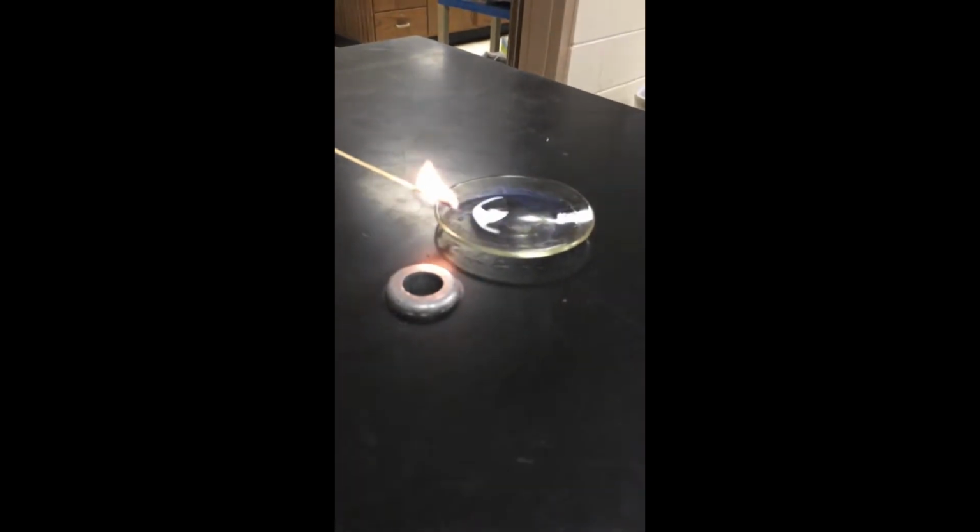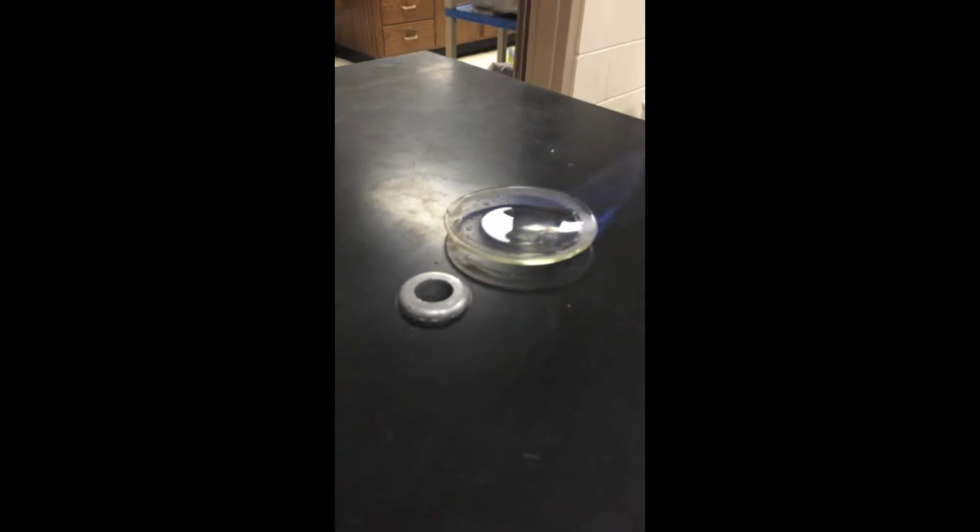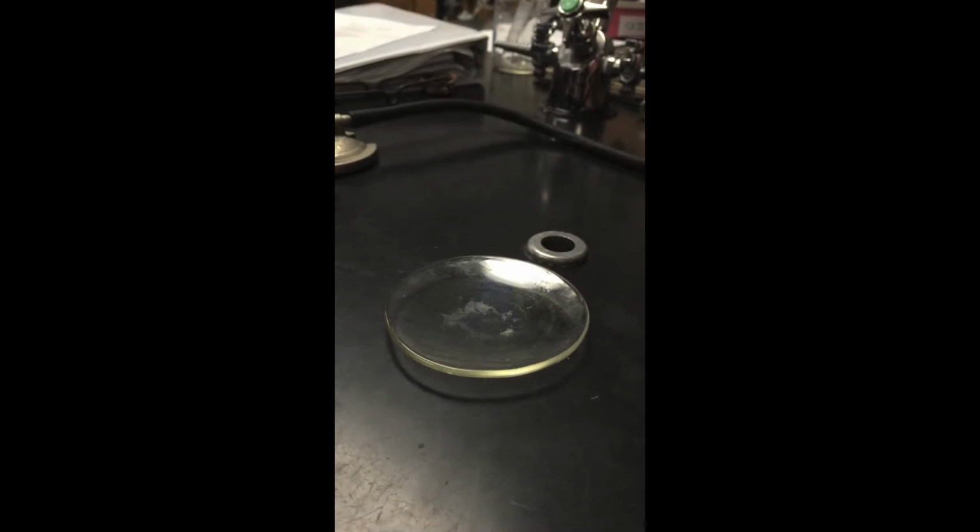We squirted a dropper full of ethanol alcohol onto a watch glass and immediately and carefully lit it with a flaming splint. The fire goes out by itself, so there's no cleanup necessary.